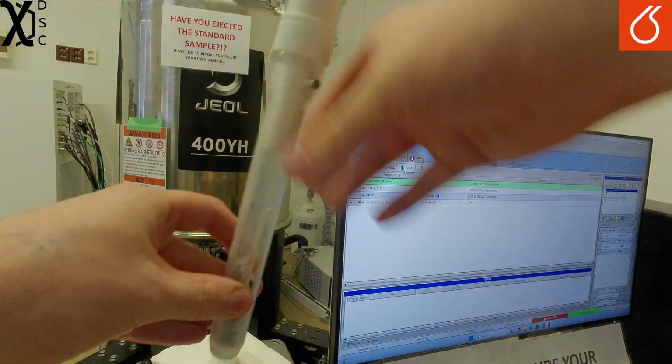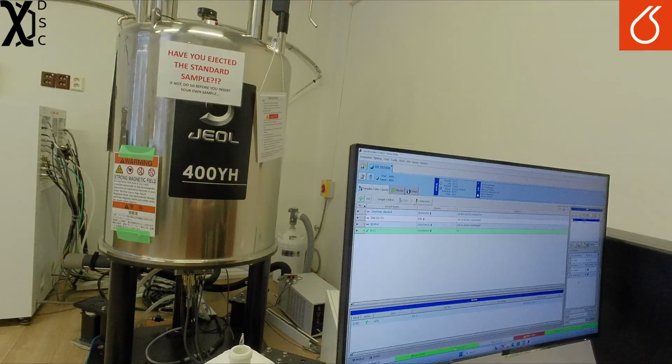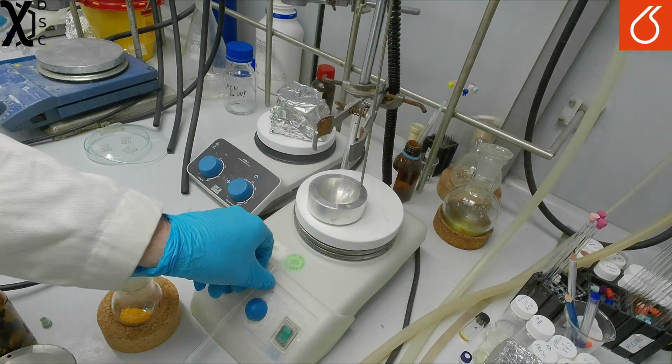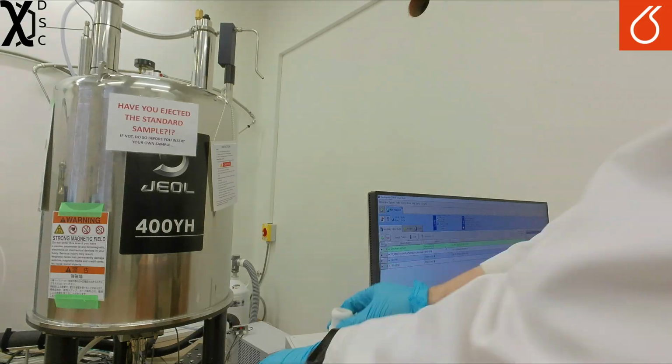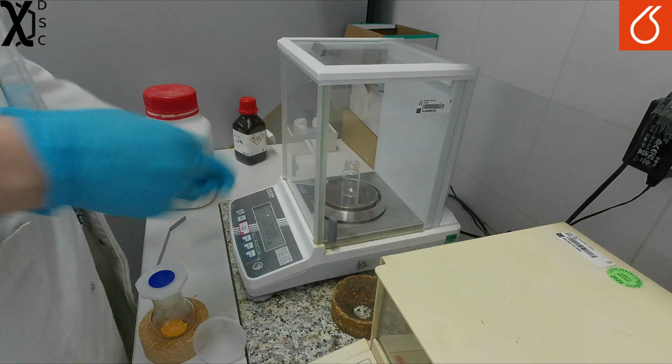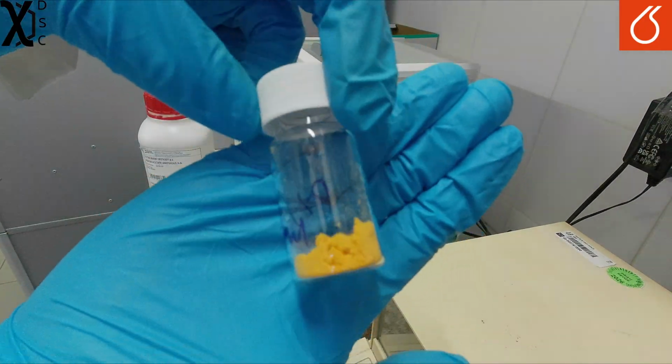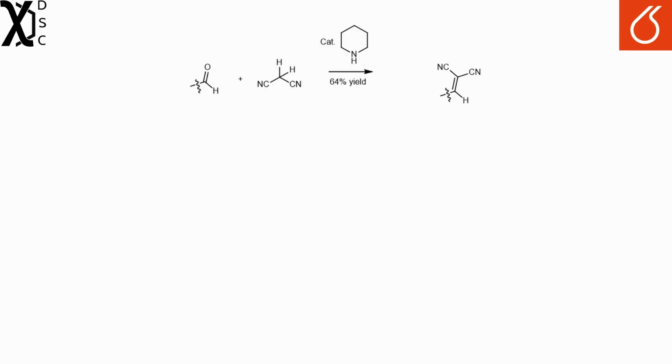and an NMR ran to determine the purity of the product that was formed. Subsequently, the compound was dried under high vacuum and another NMR ran to determine the purity, which was high. Finally, the product was weighed to determine a yield of 64%. It is likely that some of the product is also in the solution, although this may have overreacted.